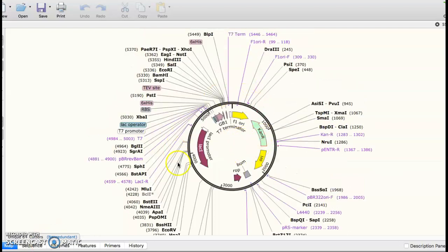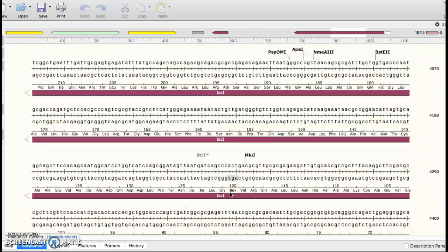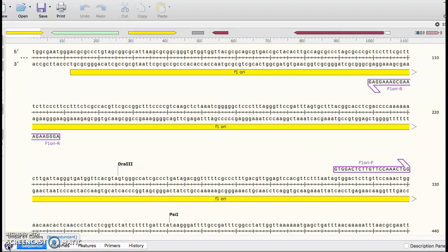and this is the second plasmid that we're going to have. Now this plasmid is going to be called a vector, and the reason we're using this as our vector is it's going to allow us to overexpress a protein of interest. So remember with the last plasmid, what we wanted to do was use scissors and cut out just the GFP gene. We just want that. And we're going to try to move that GFP gene over here and paste it into this vector right here. So that's going to be our goal. Same deal here. You can look at the map, and then you can also look at the sequence of the A's, the C's, the T's, and the G's and see what's happening.